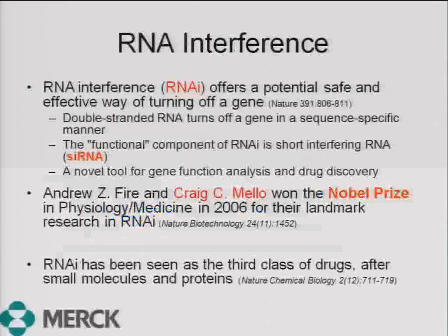So now I think I know what RNAi stands for, and I will skip this page. So for RNAi high-throughput screening, the basic process is we start by selecting a library, and the RNAi library is either an siRNA library or an shRNA library.